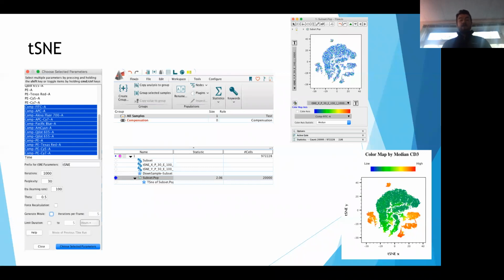So just a brief overview, if you were going to try and do this, you would load the samples of interest into a FlowJo workspace, probably gate down to your populations of interest, select those populations all at once in a given workspace, right-click on one of the populations that's been selected and choose Export Concatenate. Once you've opened up that Export Concatenate window, make sure you are in the Concatenation tab. And when you concatenate the files together, you'll get one sample that comprises all of the events in whatever populations you had selected before. When you run tsne on that concatenated file, again, you'll have a common set of tsne parameters with which you can look at it and compare between different samples. So that's the way that you would do that.